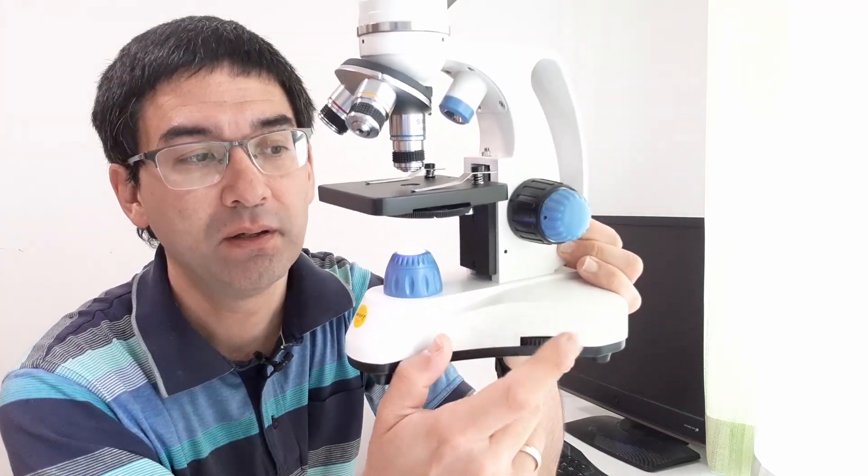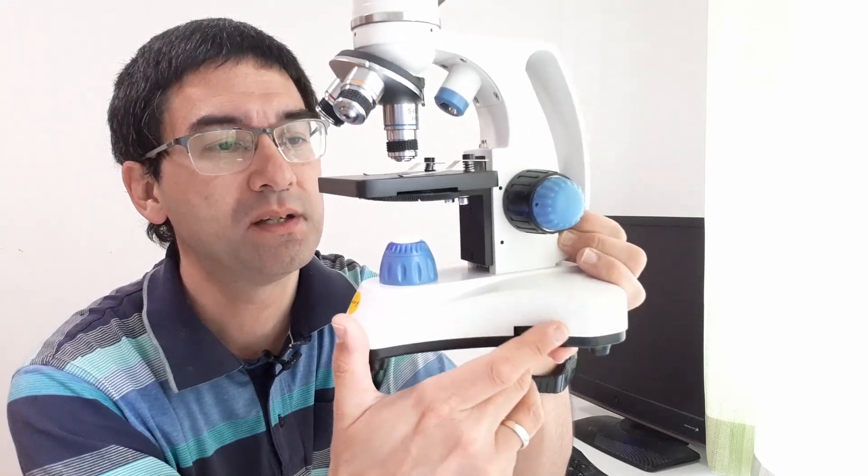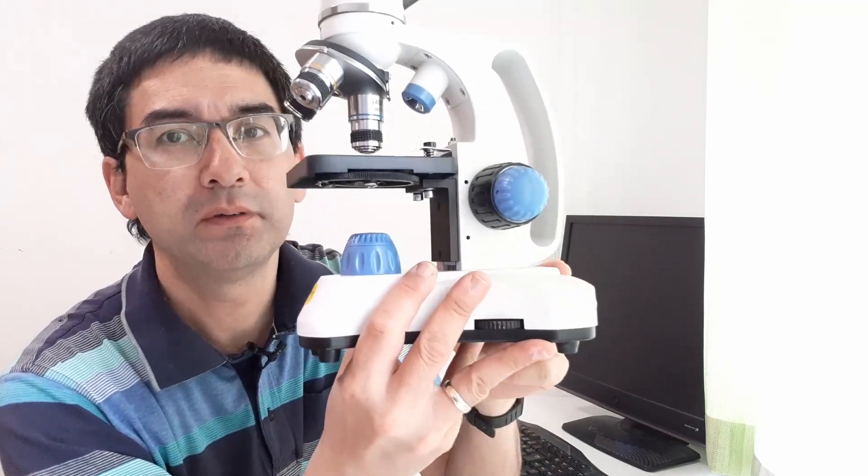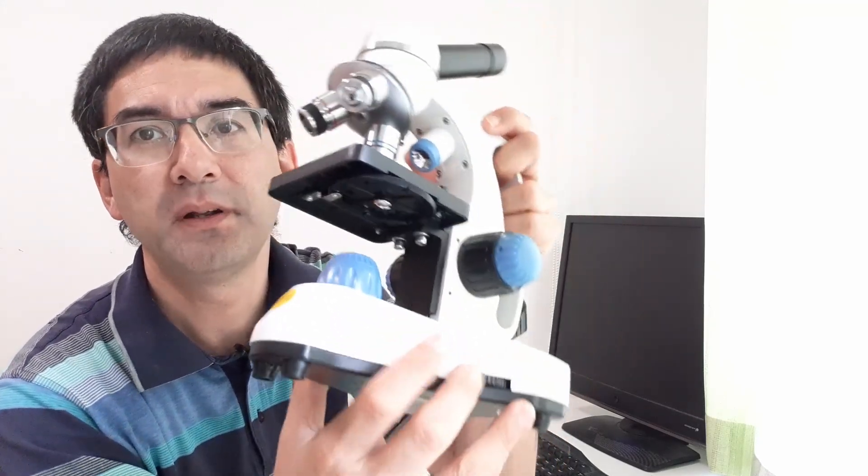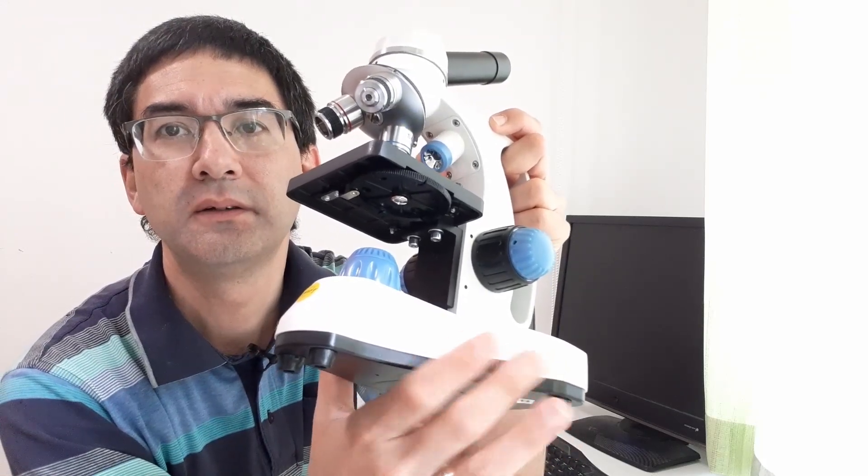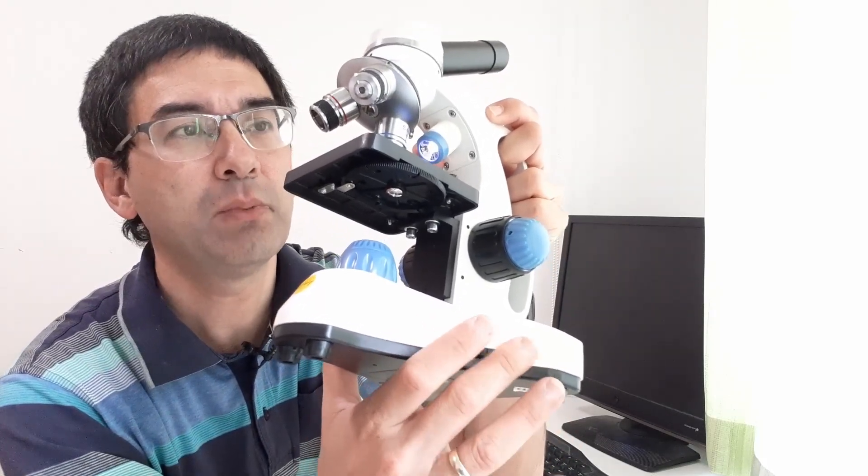This wheel here is actually useful. And by the way, in the back when I flip it over, same for the top lamp as well. So that is actually quite a nice thing.